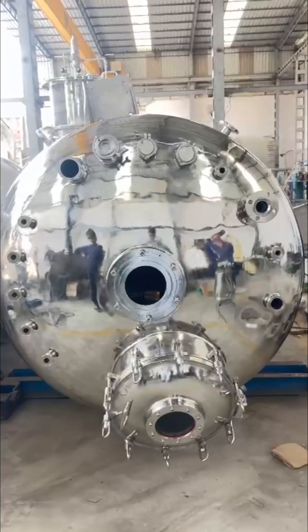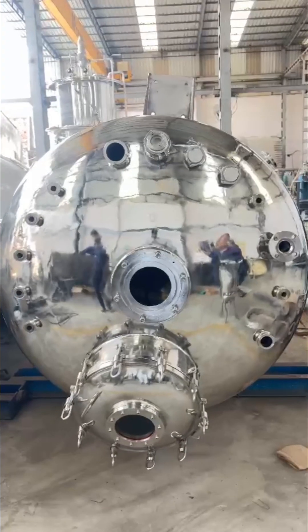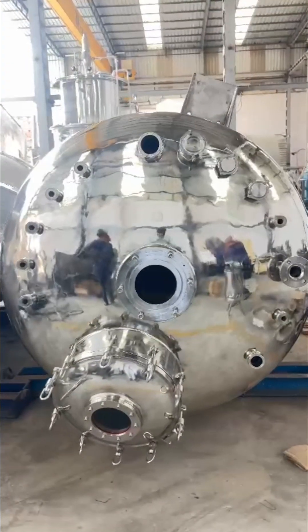The entire setup is then insulated and elegantly cladded with stainless steel, creating a sleek, polished finish.